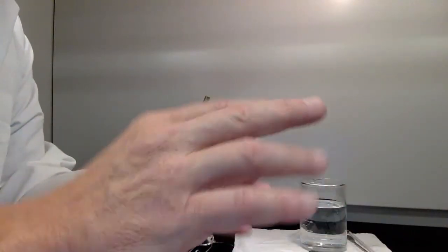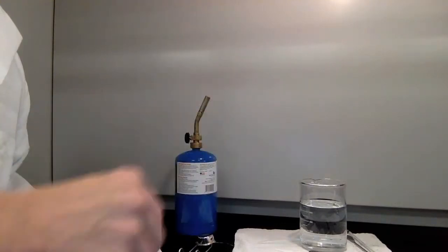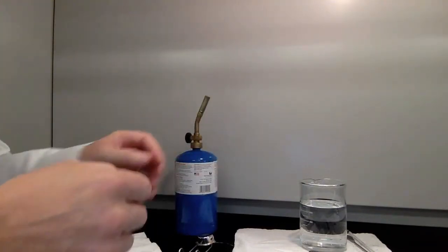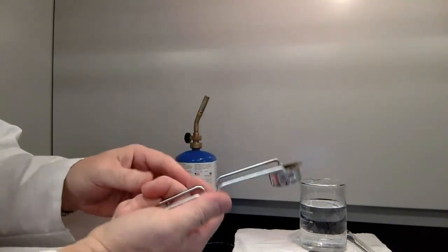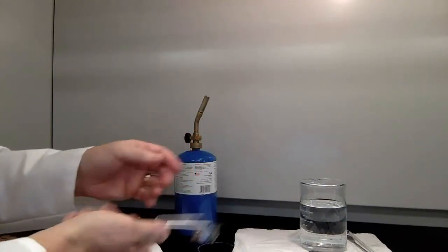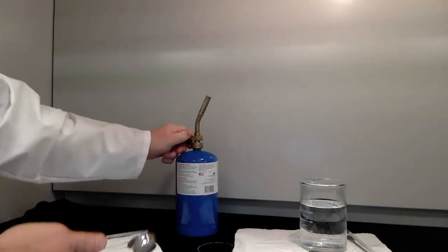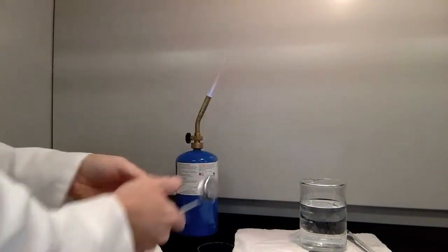You'll notice, by the way, I've taken my gloves off. It's only because I am no longer using the corrosive substances that we were earlier, and I don't want to have these vinyl gloves on while I'm trying to light this torch. To light the torch, I have a sparker, and it provides a spark in order to ignite the torch. So I'll gently turn the gas supply on and then use the sparker to ignite the torch.